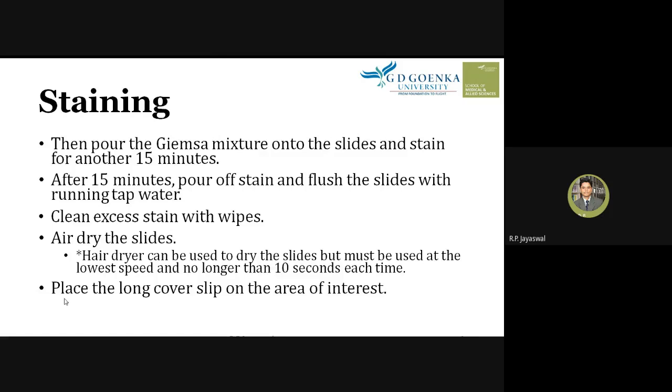Next step is to place the cover slip on the area of interest. Means you can put the cover slip over the smear, and after that you can examine it under the microscope.